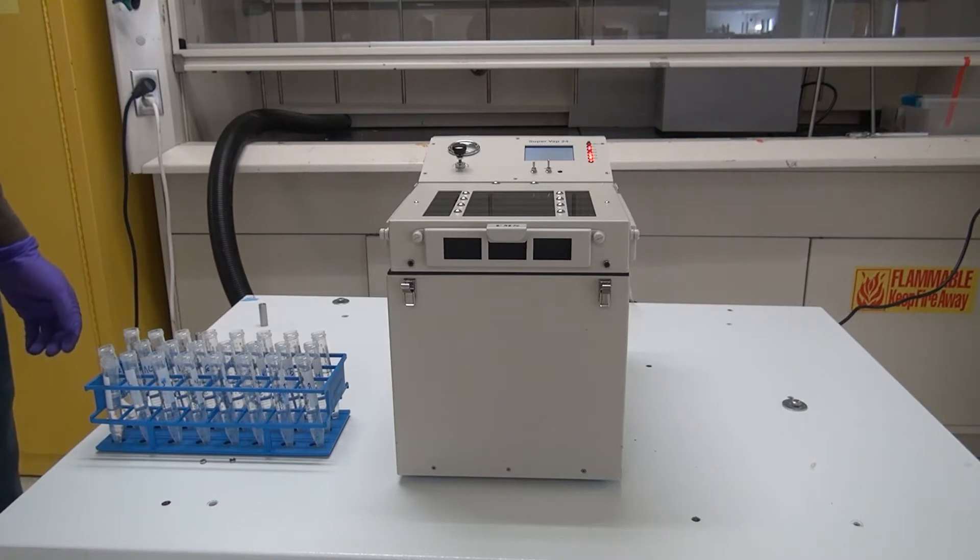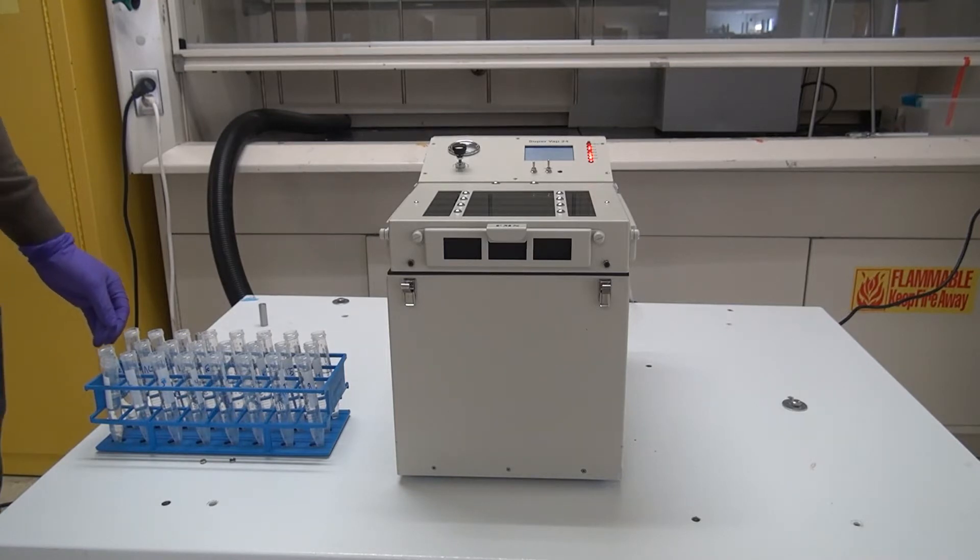This is our latest SuperVap concentration and evaporation system. It's specifically designed for evaporating up to 24 vials at one time for the analysis of PFAS. So this is the SuperVap 24 PFAS system.